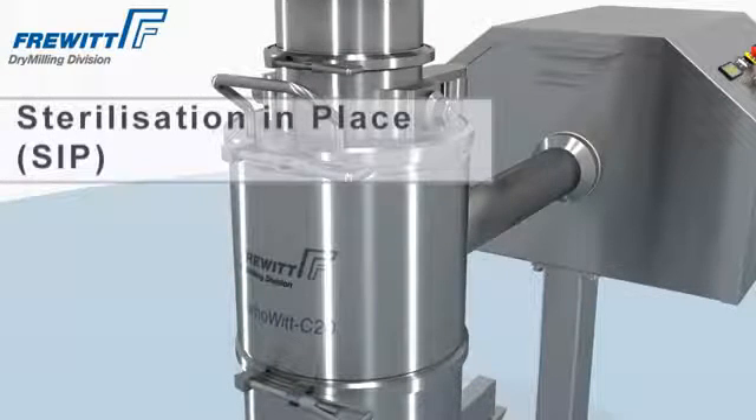The following sterilization SIP sterilizes the TurboVit mills completely.